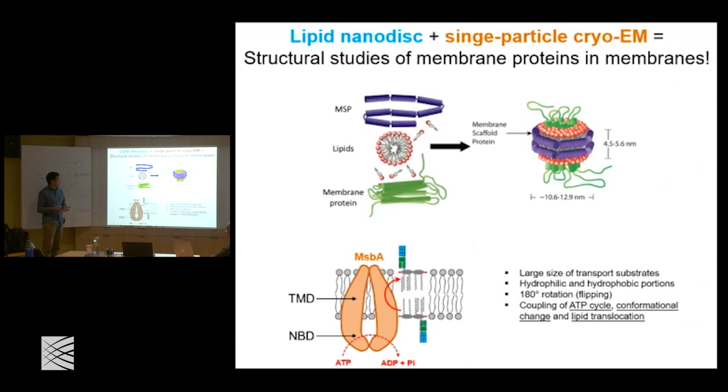For people not familiar with this technique, it starts by solubilizing your target protein, the lipid you want to incorporate, and a membrane scaffold protein, which is derived from apolipoprotein.